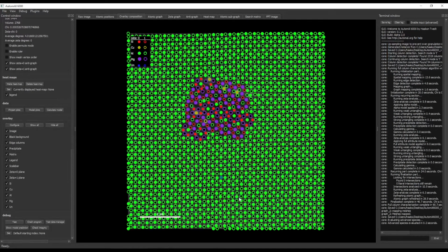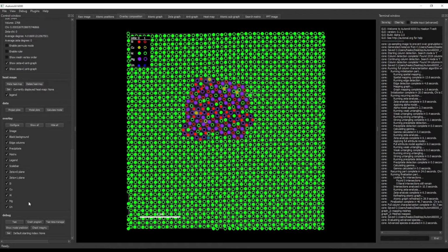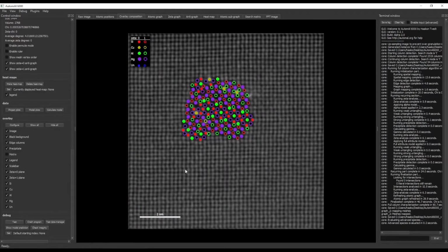It's a bit buggy but never mind that. And so now perhaps you want to export this somehow. There are two intended use cases for this. The first one is to actually generate these overlays, and the graphics here are not very beautiful, they're kind of basic, and maybe you want to do something better and more fancy for your publications.